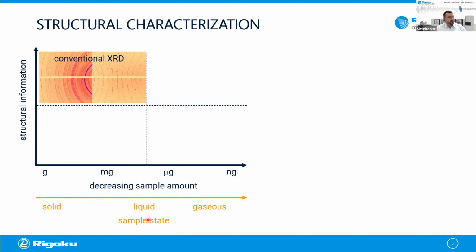Either it can be single crystal diffraction, so you get your chemical structure out of it very nicely, or you could also characterize larger amounts in terms of powder diffraction. If your sample is not a solid, but can be dissolved into some solvents, you can still do NMR with two-dimensional spectroscopy. You could determine positions of hydrogen atoms and so on.